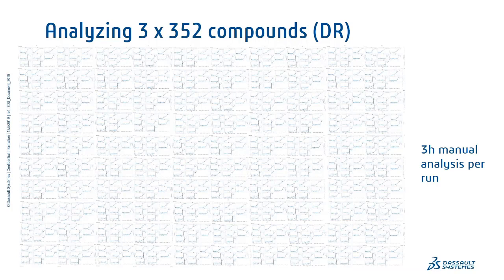Yes, so I'm going to talk about a very specific use case I have encountered in my work with a customer using BIOVIA assay, doing a screening campaign on 3 times 352 compounds.